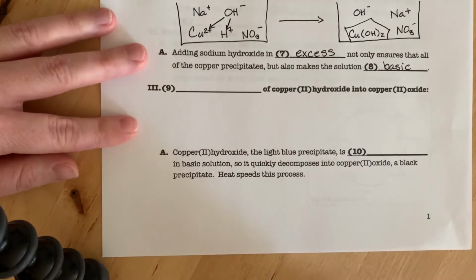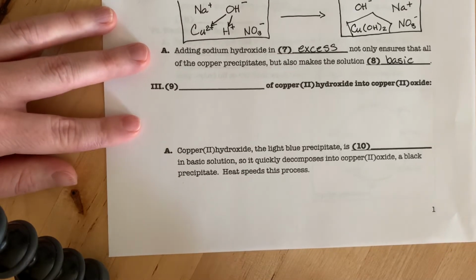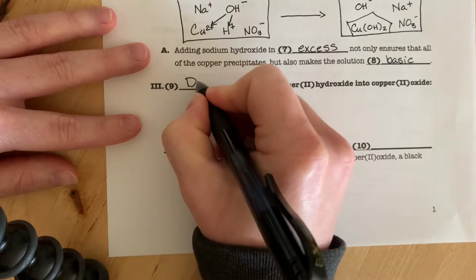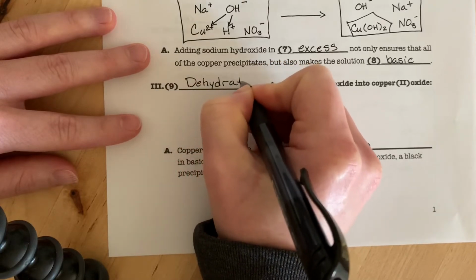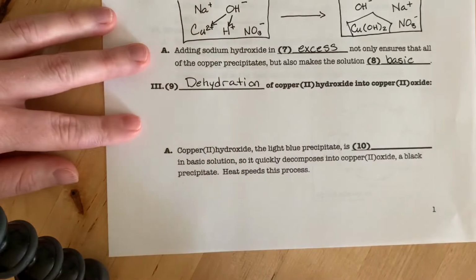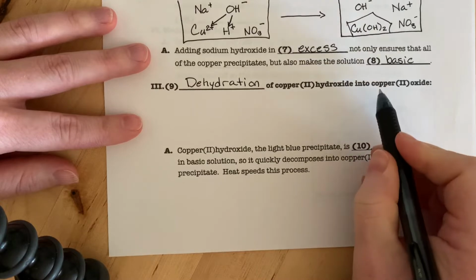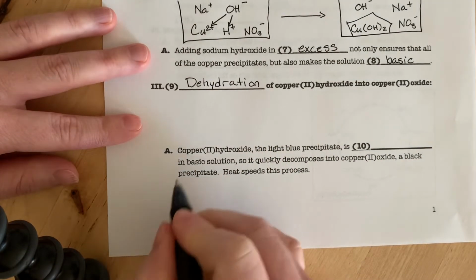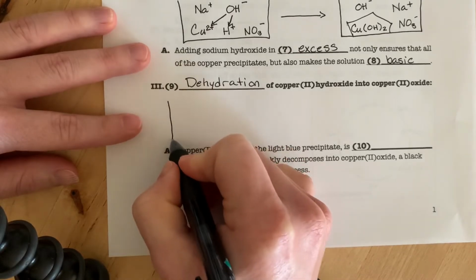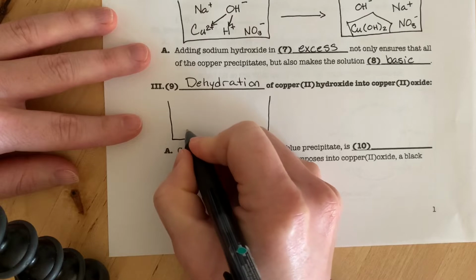So next reaction happens spontaneously. We don't actually have to add anything. It is the dehydration of the copper 2 hydroxide into copper 2 oxide. It's going to lose some hydrogens. So our before picture looks exactly the same.